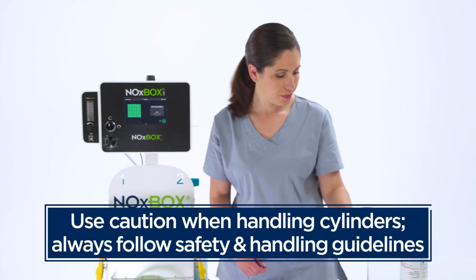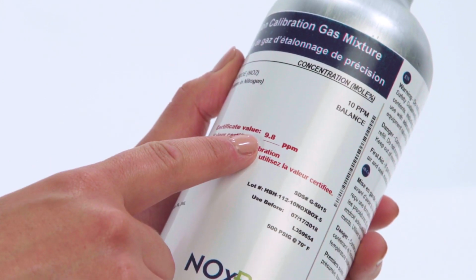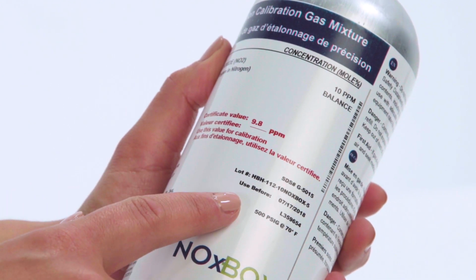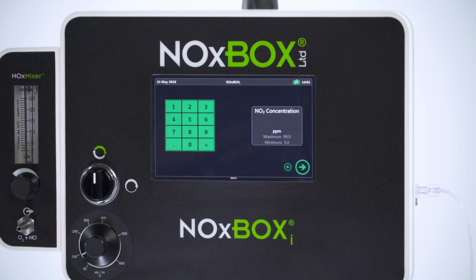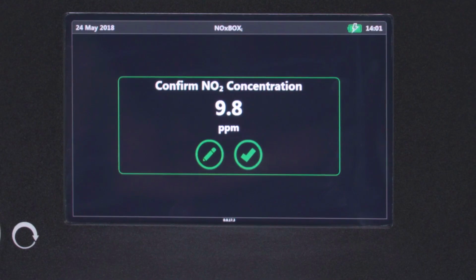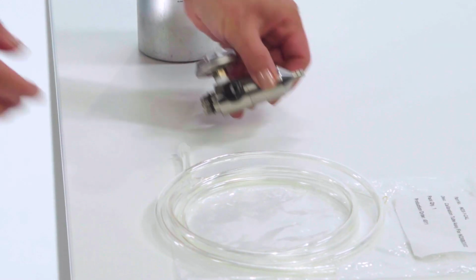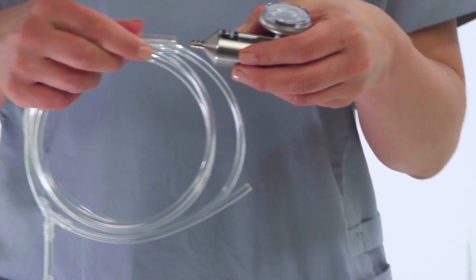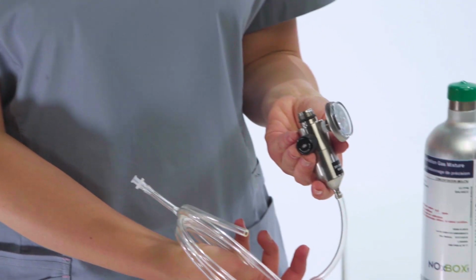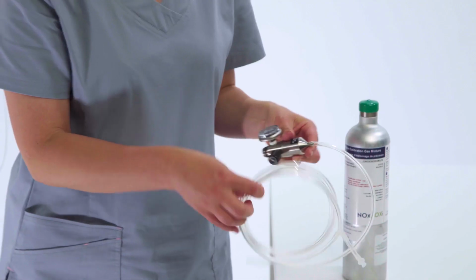Verify the calibration gas cylinder content printed on the cylinder label. In this demonstration, we are confirming 9.8 parts per million nitrogen dioxide and confirming the expiry date is correct. Enter the concentration value stated on the cylinder and press the forward arrow to continue. Confirm the concentration entered is correct. Push the long open end of the calibration Y piece over the regulator output barb to connect. Rotate the regulator valve counterclockwise to ensure the valve is open. This helps prevent cylinder contamination.